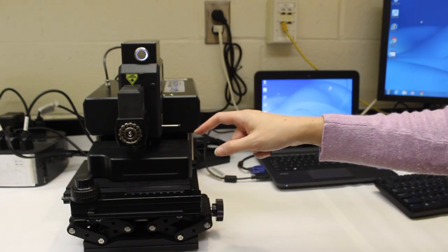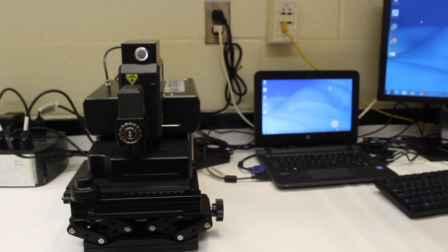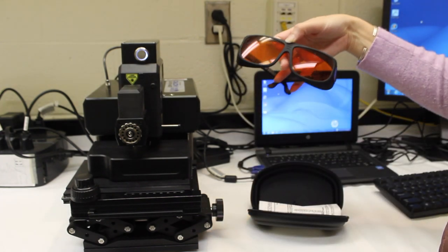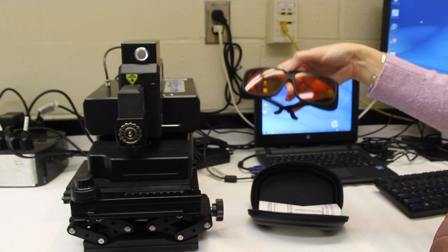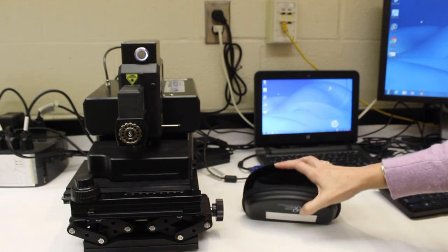The cover also protects your eyes from the laser that shoots the sample. We also have safety glasses that look awesome, but they're designed to filter out the wavelength of our laser, which is a green laser, for safety. You should wear those while you're actually analyzing the sample.